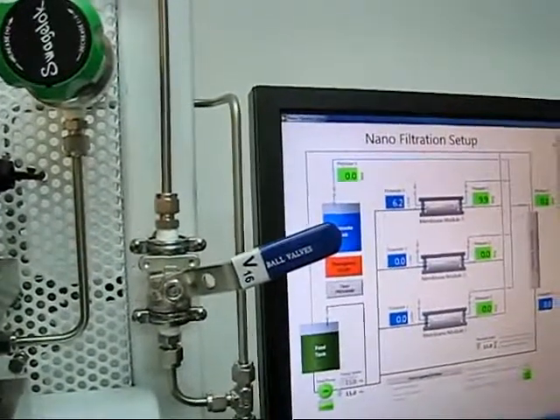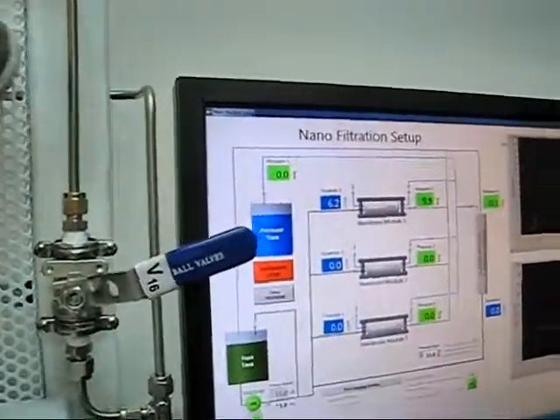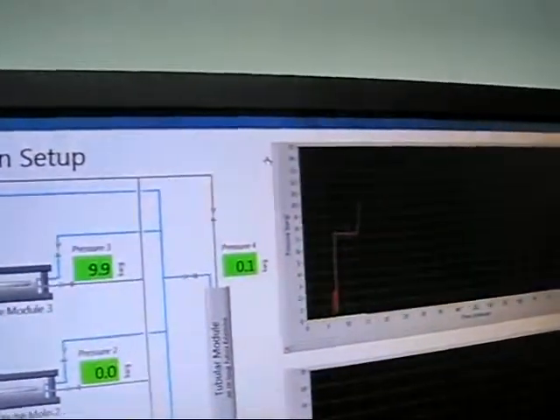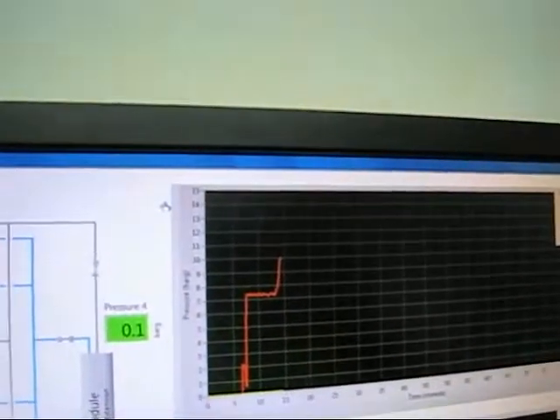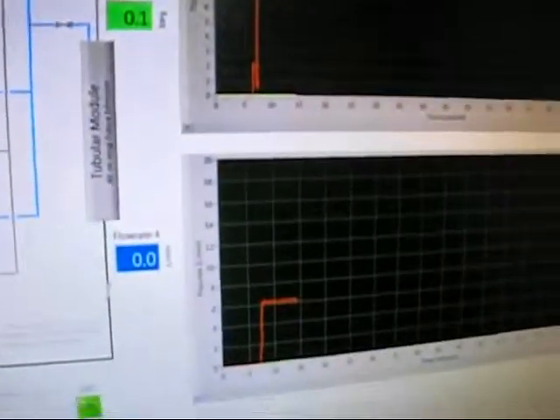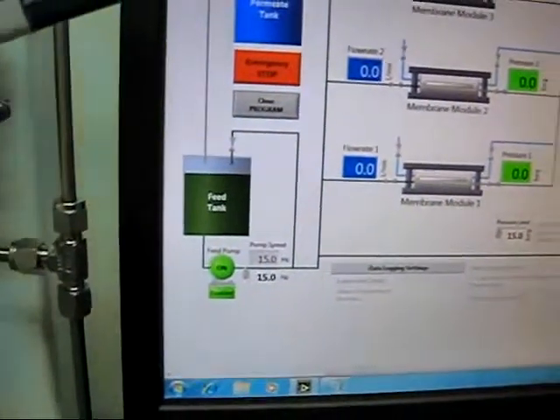We have got 10 bar back pressure across the membrane right now. You can see on the graph that the pressure value has shot up, while the flow remains relatively steady at a flow frequency of 15 Hz.